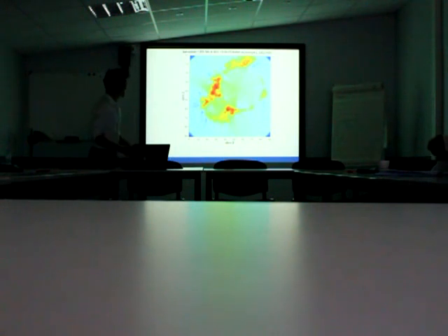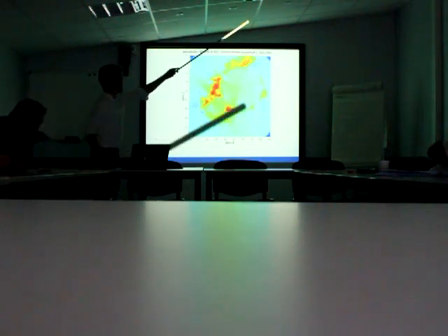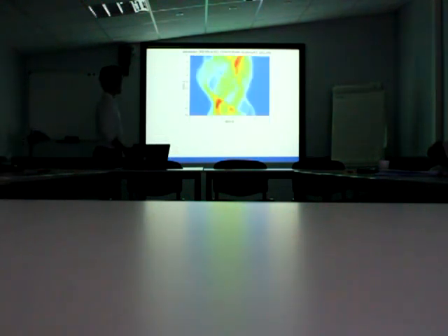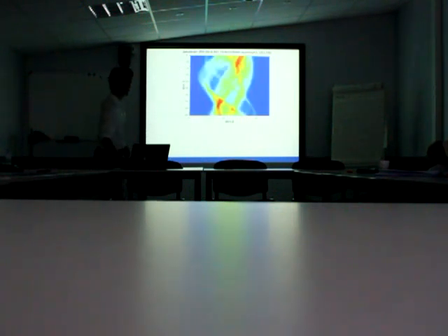Here's the sinogram of the wax phase. The reconstruction of the wax phase. You can see there are some voids where you have the glass spheres. This is the sinogram that it was reconstructed from, without the corrections. I don't know if you can see kind of jagged lines, which in the corrected version is a bit better. What did you use to visualize this?